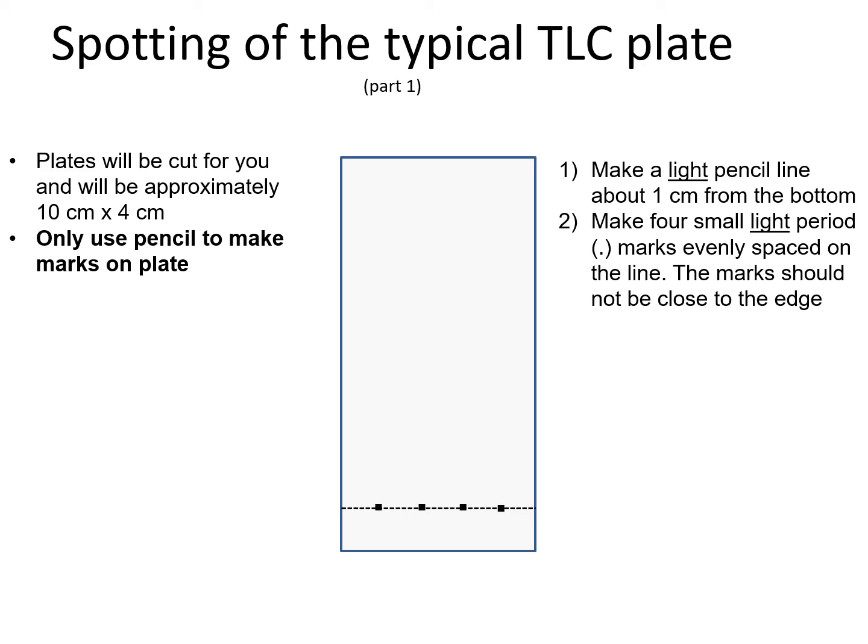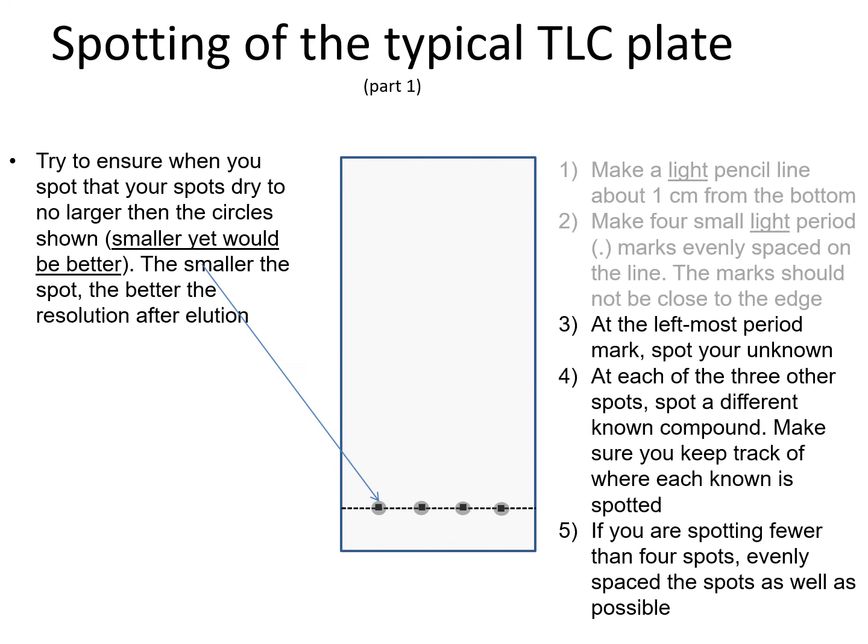For sure, a TLC plate will be prepared in the lab at a desired size. Your first task is simply to line the plate with a pencil from 1 to 1.5 centimeters from the bottom, and then you have to mark the line at different points, still with the pencil.